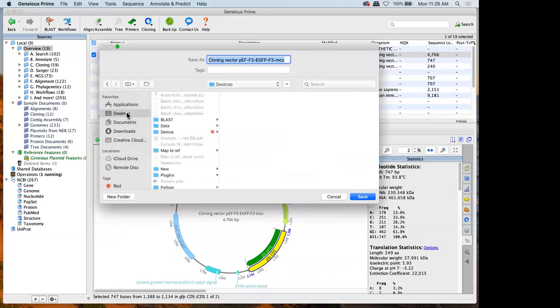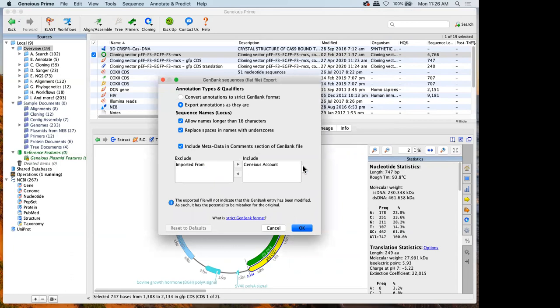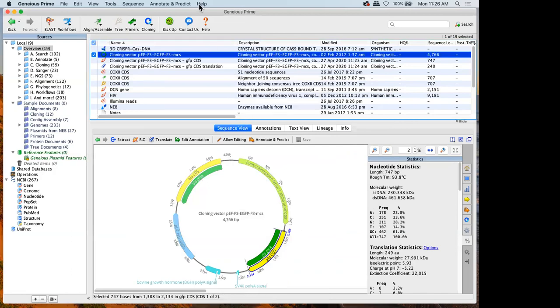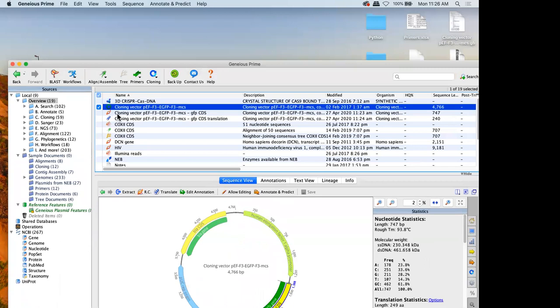This is actually one case where Windows and Mac again look a little bit different. In Mac, it's 2 windows. If you're on Windows, it's going to go straight to something that looks like this, and there'll be a drop-down box. That's where you choose the file format. And then depending what file format you chose, you might see some additional windows that can let you specify how to format that file.